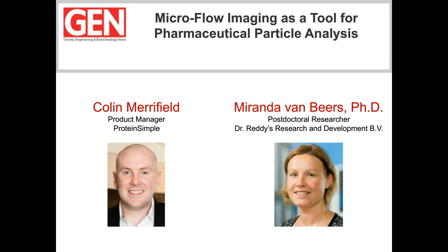Let's meet our speakers for this GEN webinar, where we'll discuss current methodologies for using MFI to assess size and agglomeration of PLGA microparticles. Colin Merrifield is Product Manager at ProteinSimple. Mr. Merrifield will provide a brief introduction into ProteinSimple and how many of its products are integral to quality MFI analysis techniques. Miranda Van Beers is currently a scientist in analytical method development at Dr. Reddy's Research and Development in the Netherlands. Dr. Van Beers will guide us through some of her current research using MFI for PLGA particle analysis and how the method can be employed during drug development.